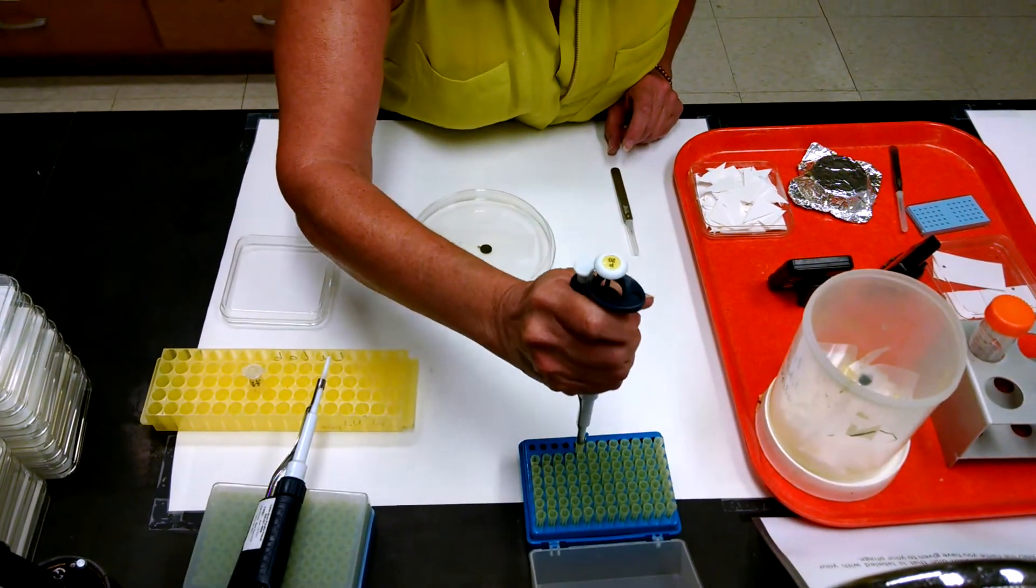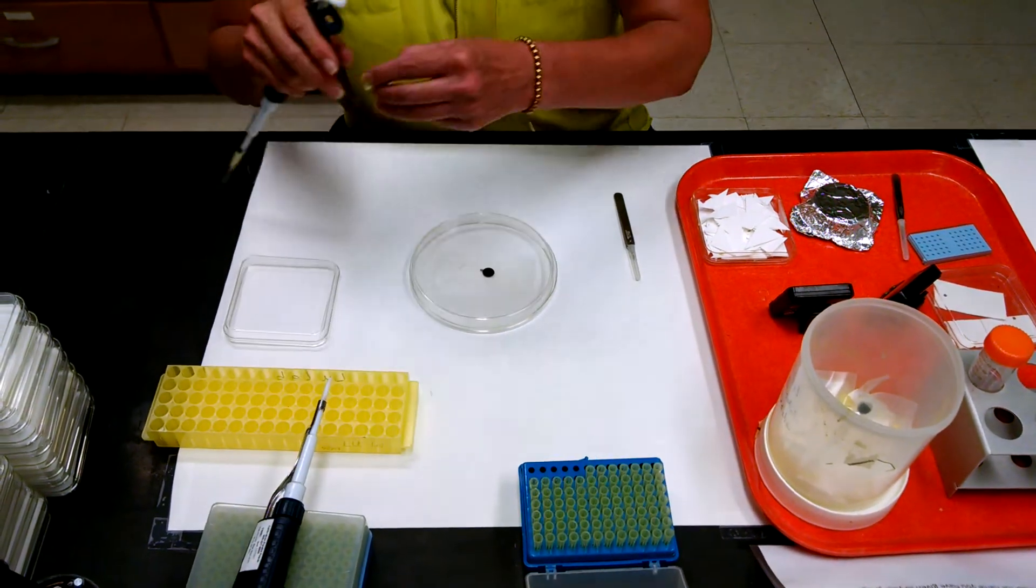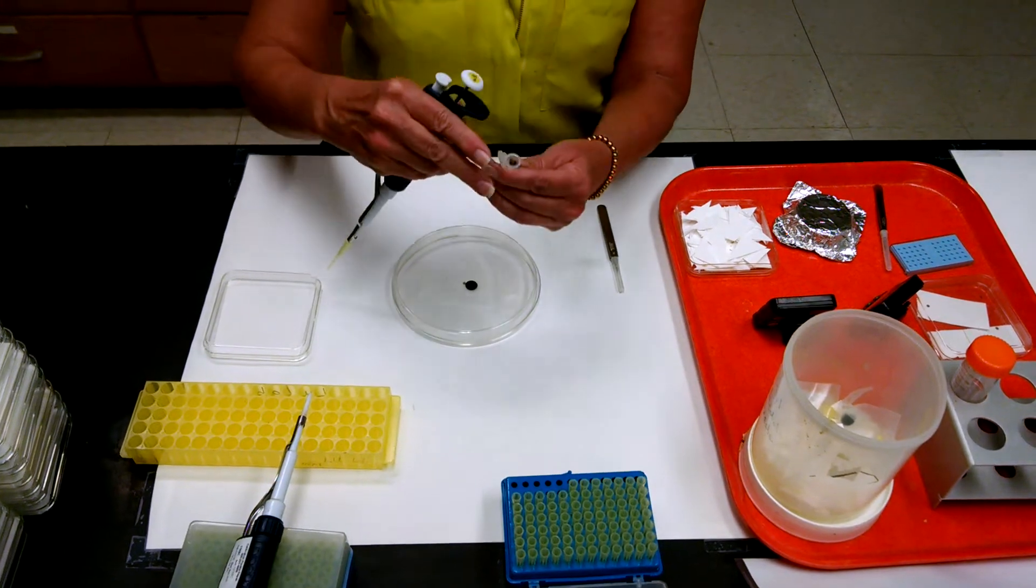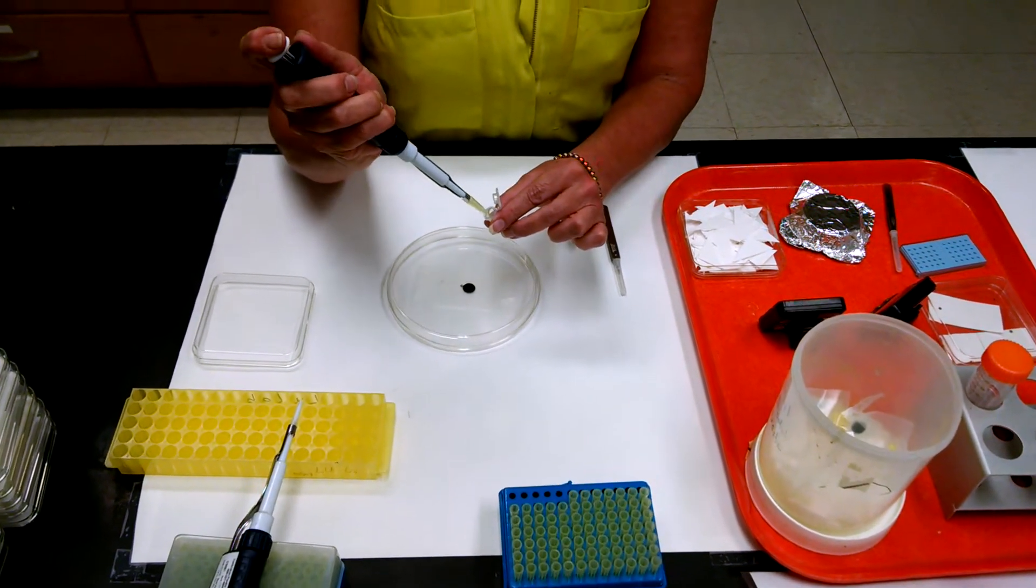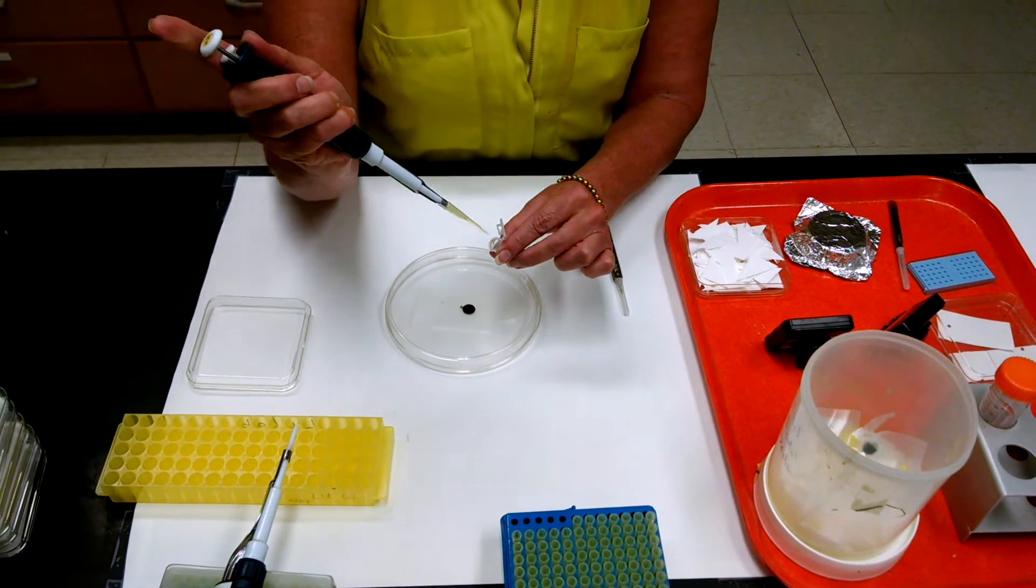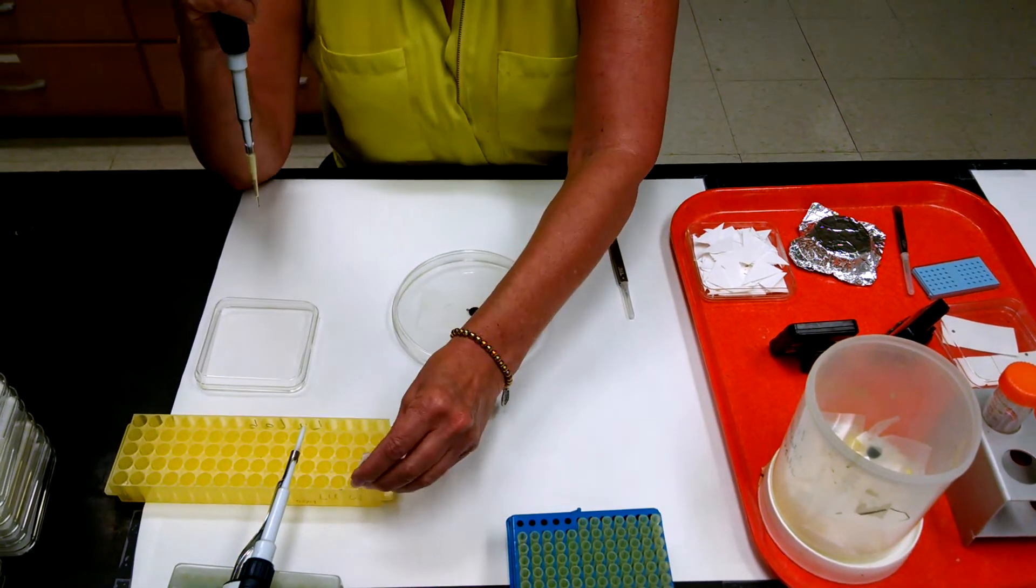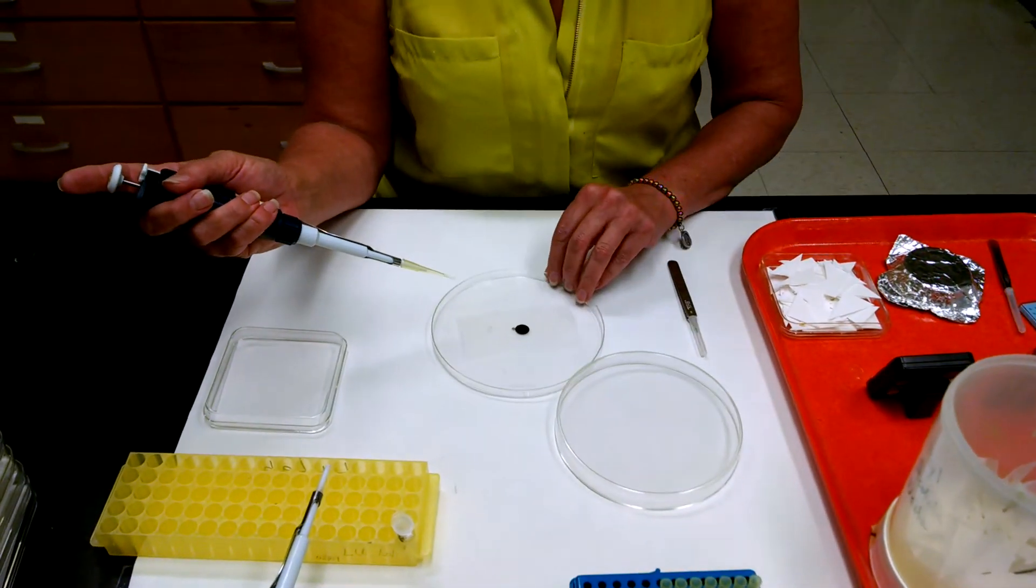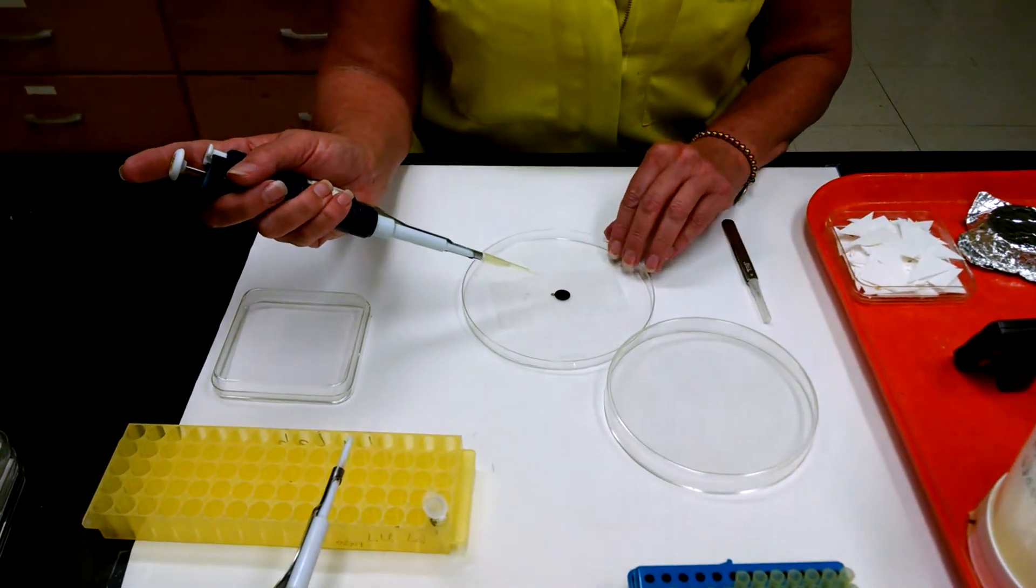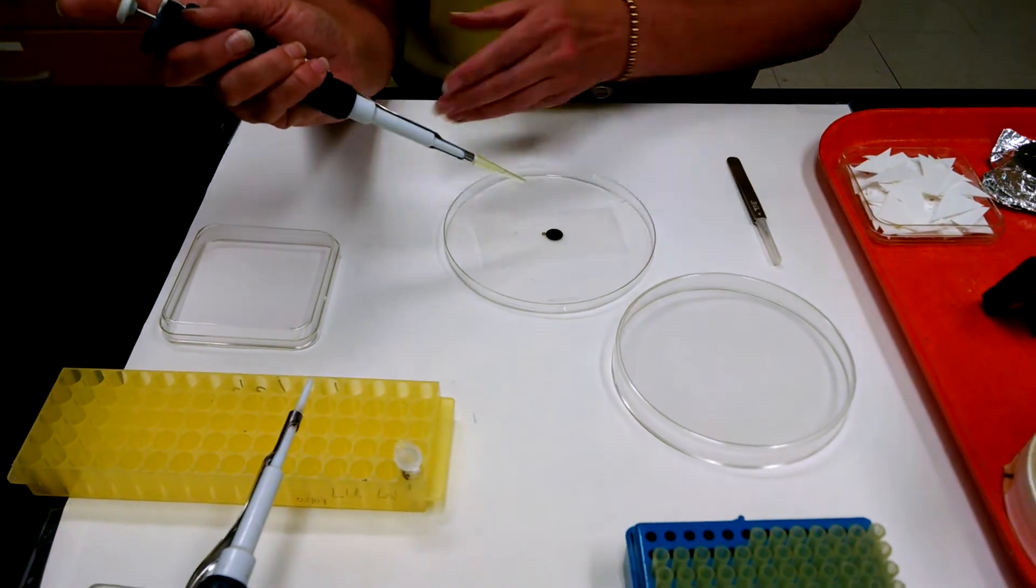Today we're going to negatively stain a grid that has a sample of phage on it. So I get my phage, I have 10 microliters in a pipette, I draw it up, and I'm going to put it on this grid. The grid is the little copper one, not the big black one.